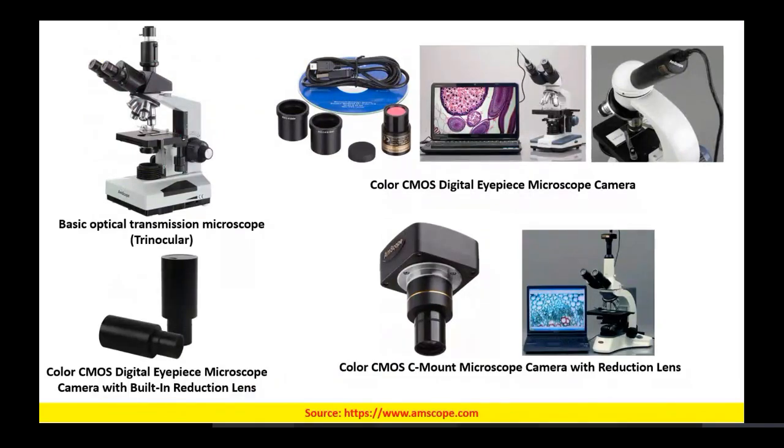So what we will be having is that in these cases, usually in the transmission microscopes, you have a filter over here. This is your excitation filter, and then if you see, there is an attachment made at this level where we have the emission filters. So an attachment is made over there.